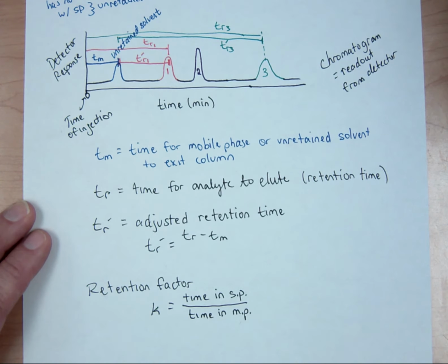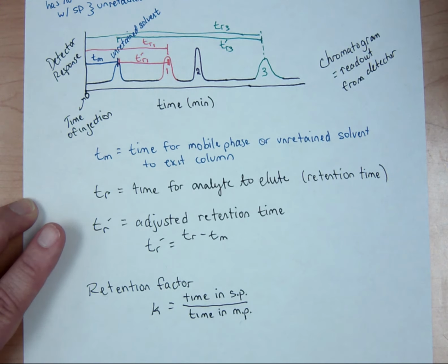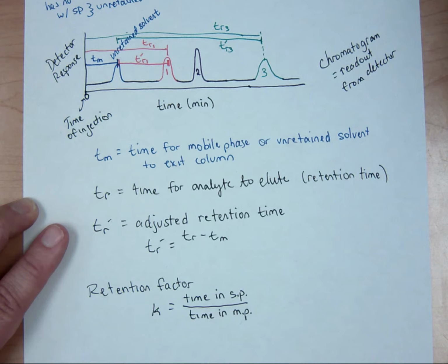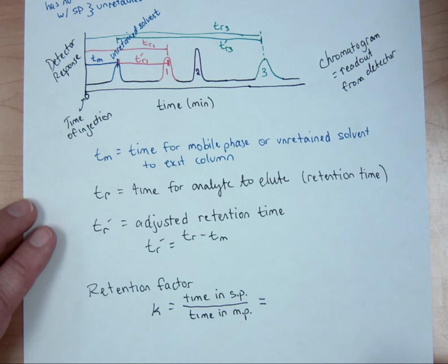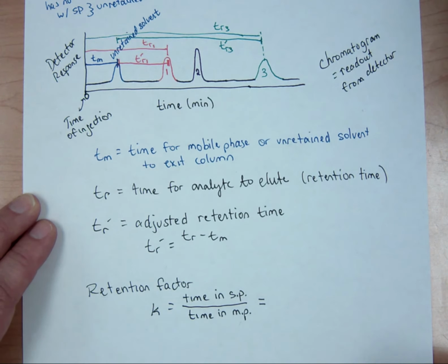So again, we're going even further from just thinking about retention time for a single analyte to taking out some of our varying factors from how long it might have spent in the column due to tubing and other kinds of factors in your instrument.